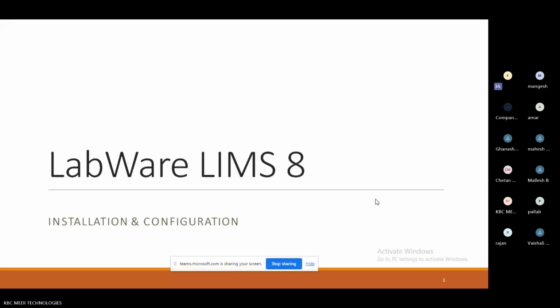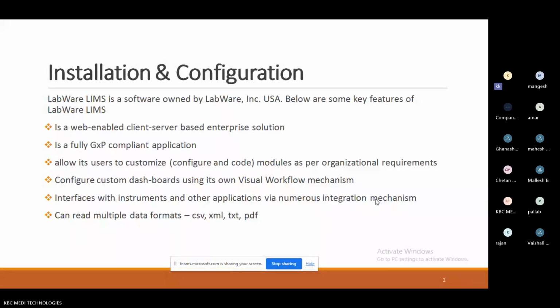See, the thing is, when we are going to discuss Labware LIMS 8 installation and configuration, first let me explain one thing. What is the difference between installation and configuration? Installation indicates you don't have the application, first of all. Okay. First, you need to perform the installation.